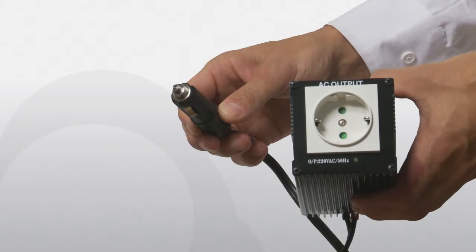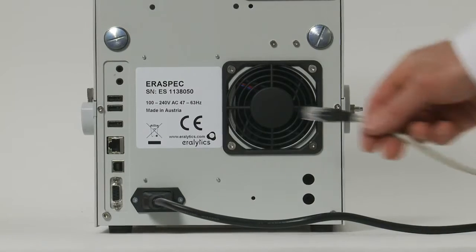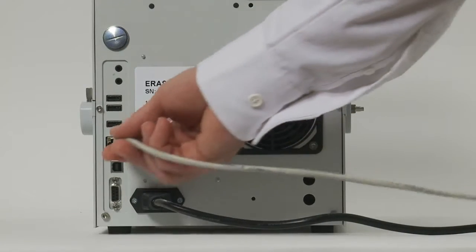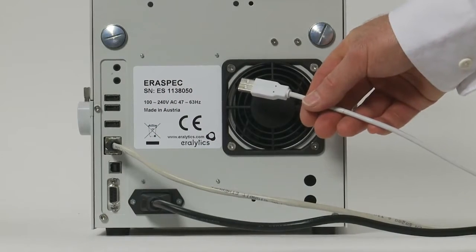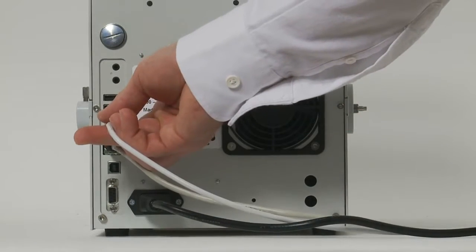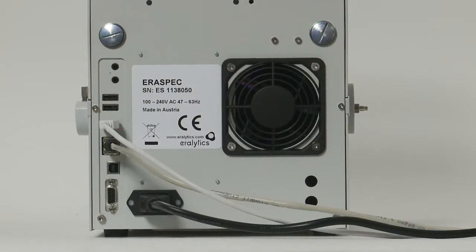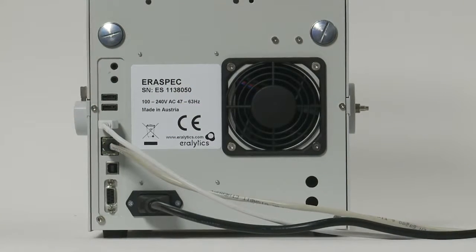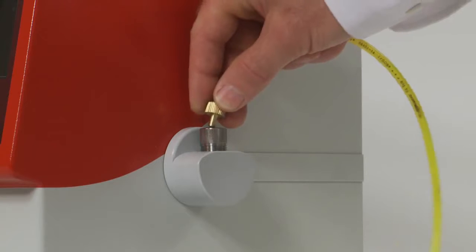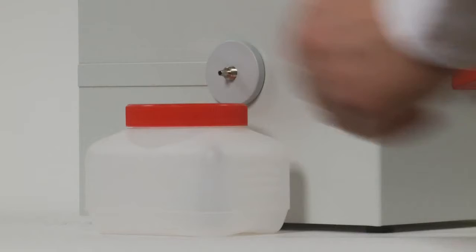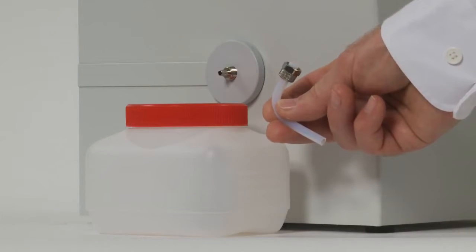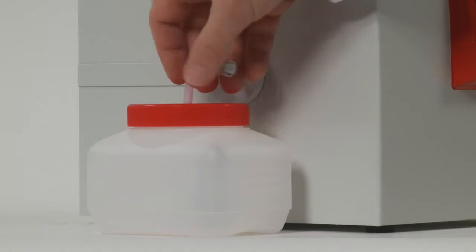For data transfer or remote control, the unit can be connected to a network by the Ethernet interface or directly to a computer or printer using the USB ports. Put the inlet tube in the Luer inlets on the right side of the instrument. Then place the waste container next to the instrument and connect the outlet tube to the outlet on the left side.